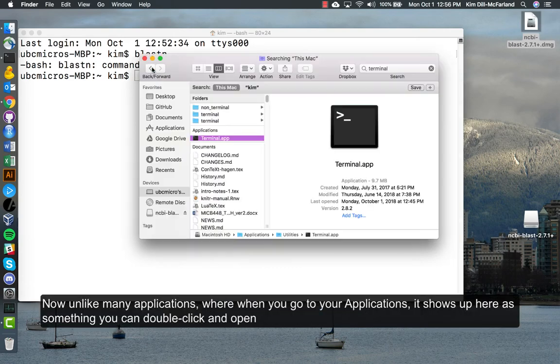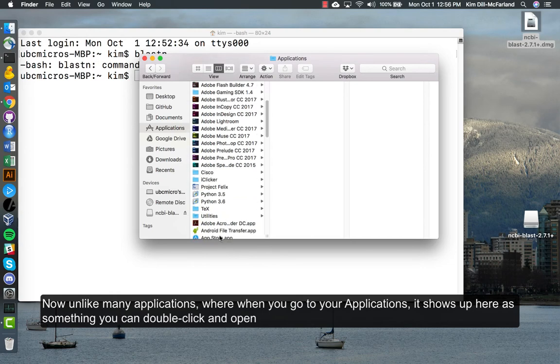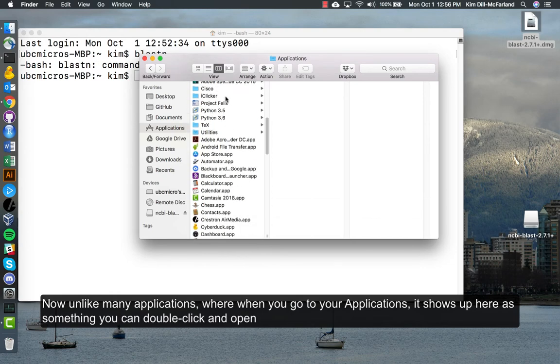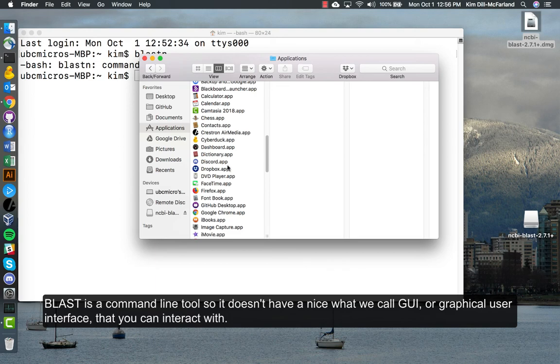Now unlike many applications where when you go to your applications it shows up here as something you can double click and open, BLAST is a command line tool so it doesn't have a nice what we call GUI or graphical user interface that you can interact with.